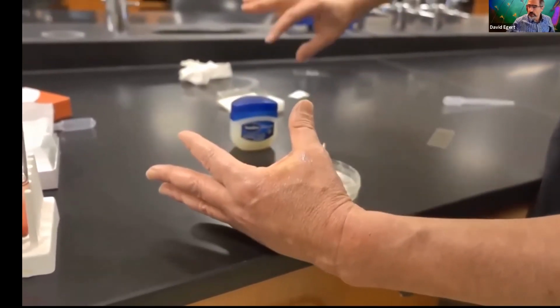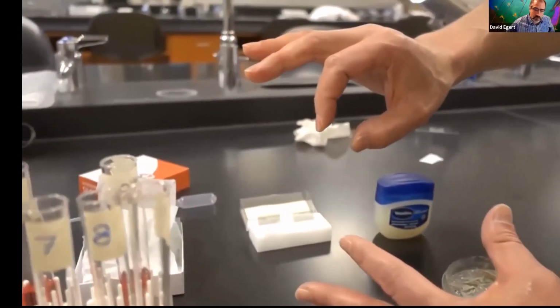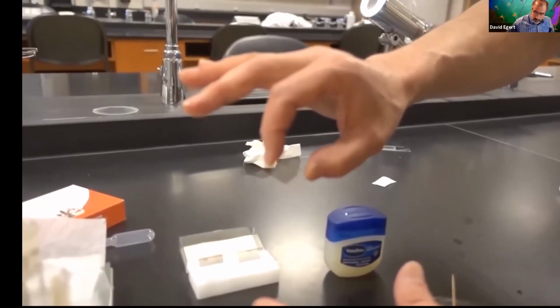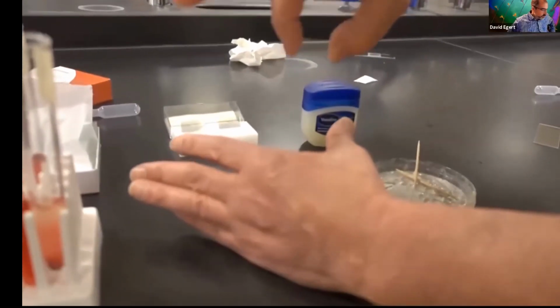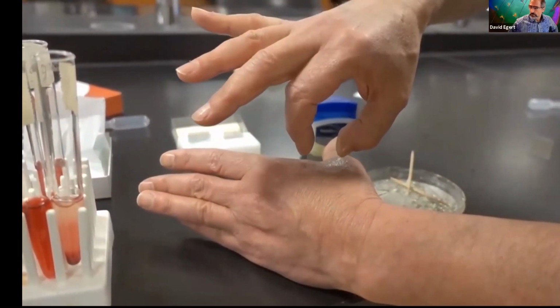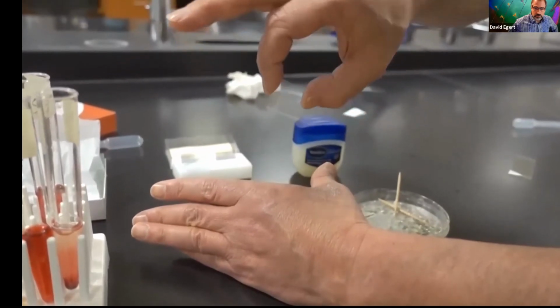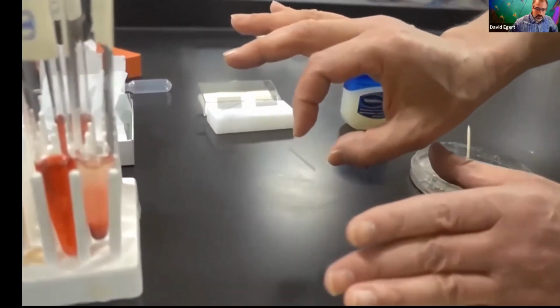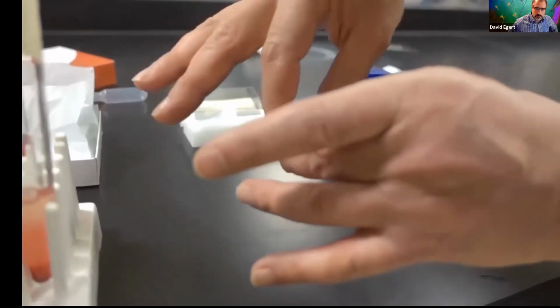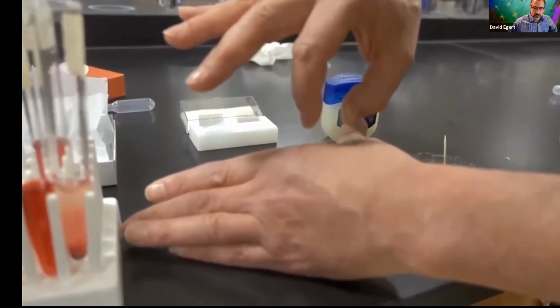Then I am going to take my cover slip, and this is just very thin glass, and I'm always going to make sure I hold it just by the edges because I don't want to get my fingerprints all over it. For each of the 4 sides, I'm going to put the side into the Vaseline and just drag it, maybe about a quarter of an inch. I don't know if you can see that, there is a Vaseline seal on that one side. And then rotate 90 degrees, go again.